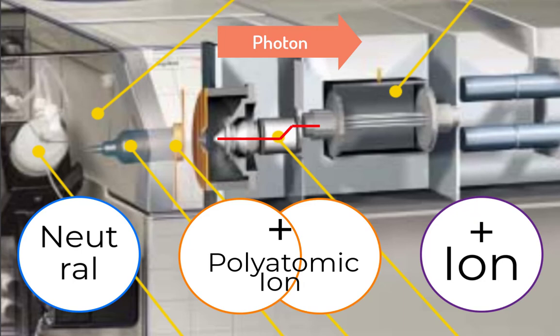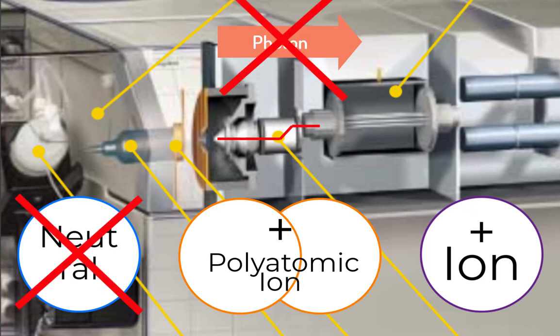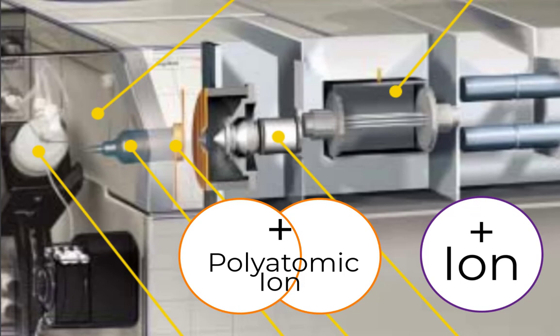And then anything that's not diverted, such as neutrals or photons, because those don't interact with the electromagnetic fields of the lenses, those will directly hit a plate at the very end and be sucked into vacuum or deposited onto the plate. And then they won't be present in the stream anymore. So we've effectively removed 2 of our 4 items right there.